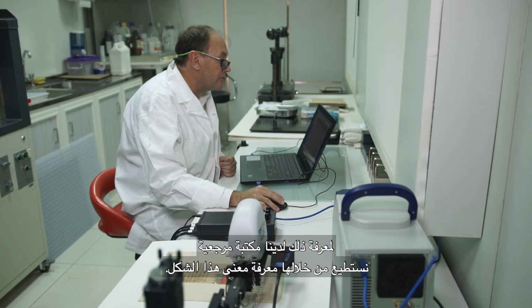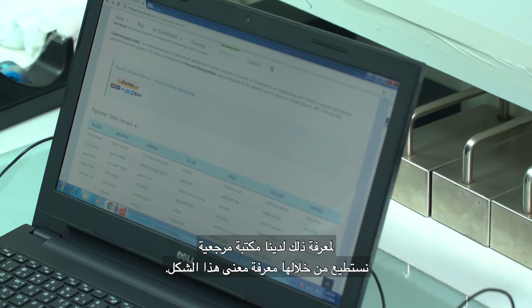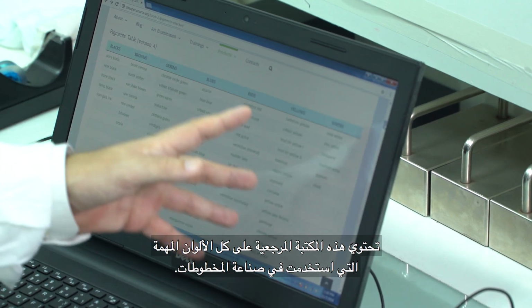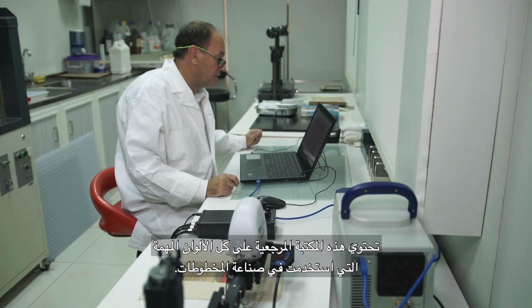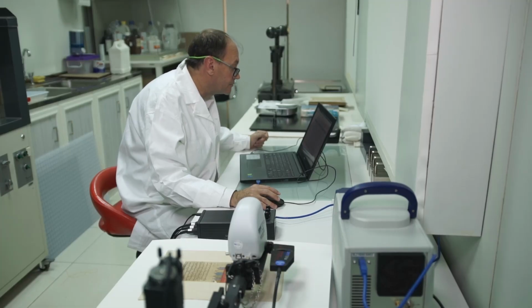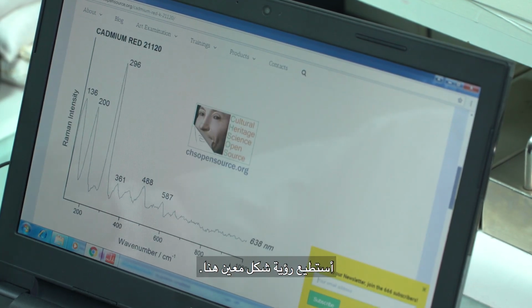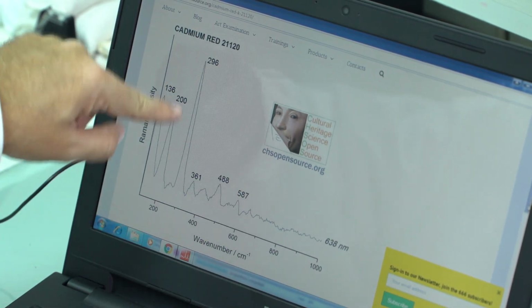For that, we have a kind of reference library in which we are going to find which spectrum it is. Here, I have a reference library with all the colors and most of the important pigments which have been used for manuscript production. And here I have all the reds. For example, I can try the first one, the cadmium red. I can see a specific spectrum here. You can see here the levels and this shape.